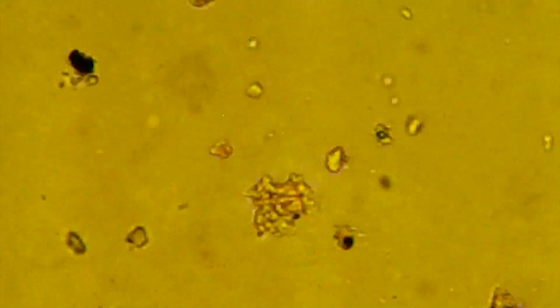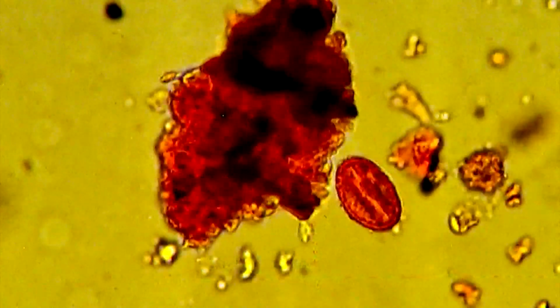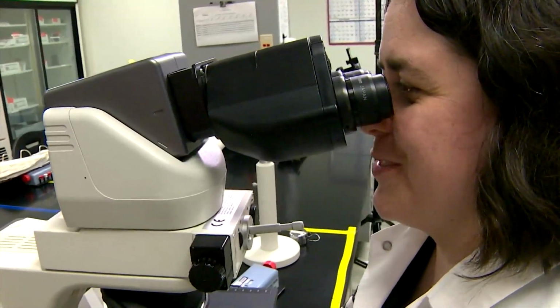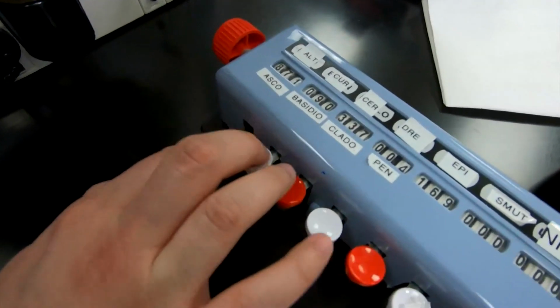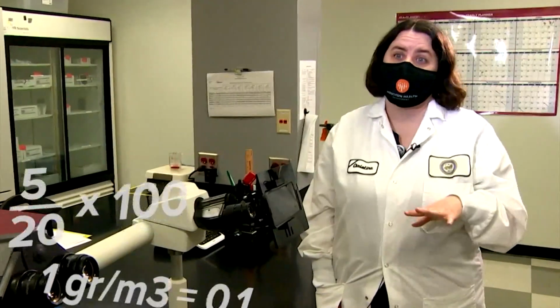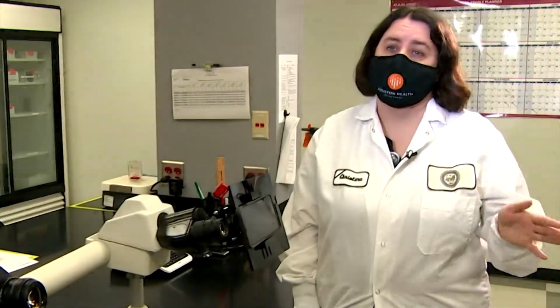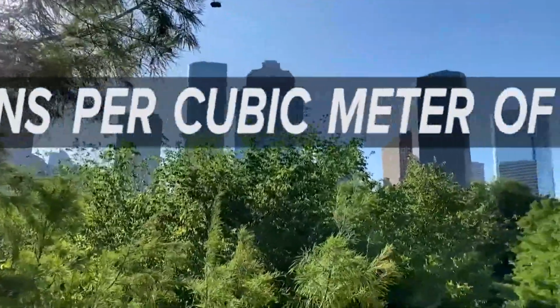I take my microscope and I literally count one by one each pollen or mold that I see. And it's a bunch of ascospores, cladospores, and basidiospores. And then at the end of my count, I will put them into a formula, and then that formula gives me the exact amount that is per the cubic meter of air. Did you get that? Grains per cubic meter of air is how it's measured. That's why she needs the formula.